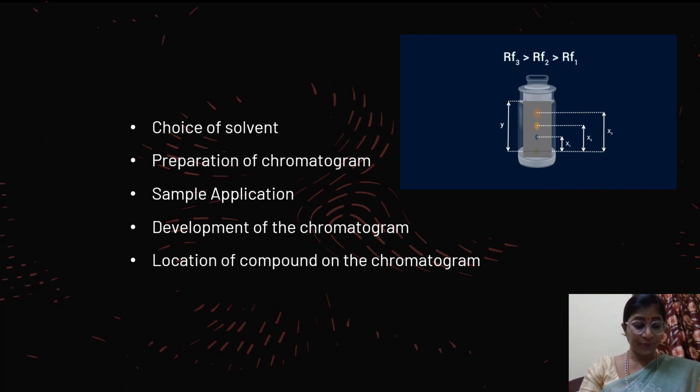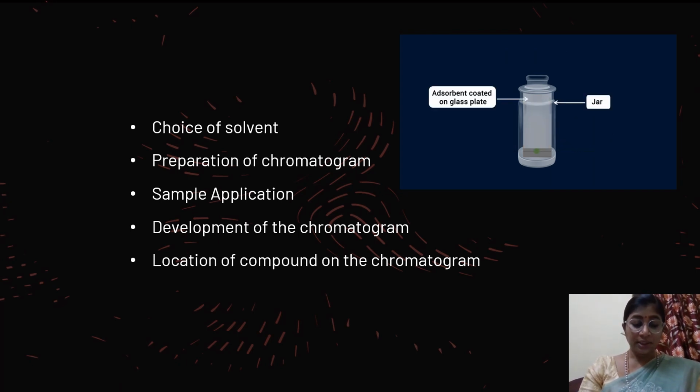Two plates are put together. They are held by the thumb and forefinger at one end. Now they are dipped in the slurry, taken out and held vertically. The solvent dries up. The dry plates are separated. Now we get two chromatoplates. There are also other apparatus for the preparation of chromatoplates.